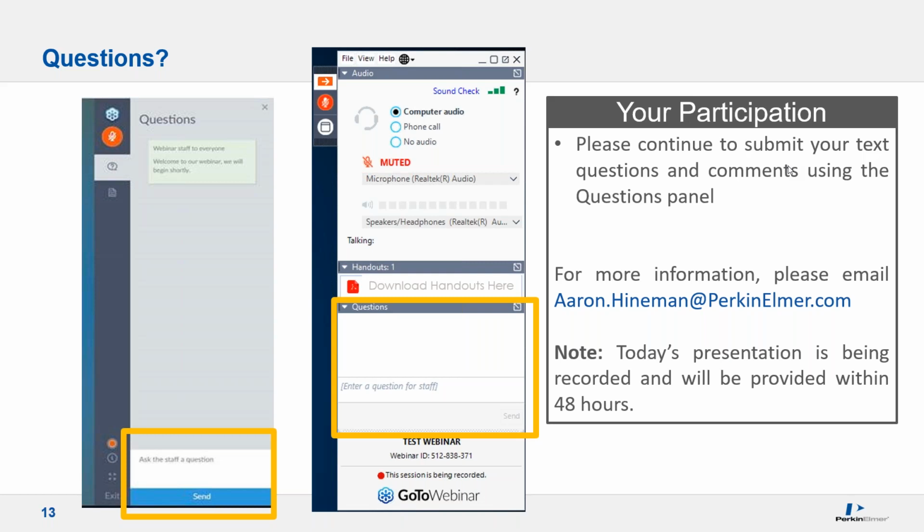Next question. Is it not a good idea to use MSF as a standard correction technique for all elements, to get better detection limits and eliminate random noise, just identifying blank and analyte only? You only want to use a correction equation as a last resort when you cannot get an appropriate result using other means that we discussed. Correction equations are last resort options.